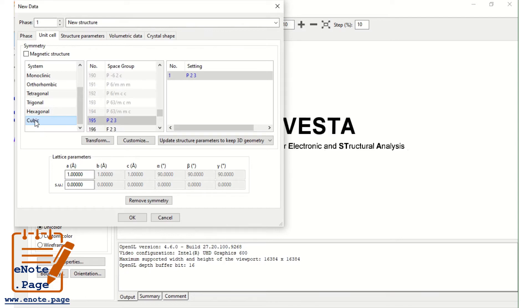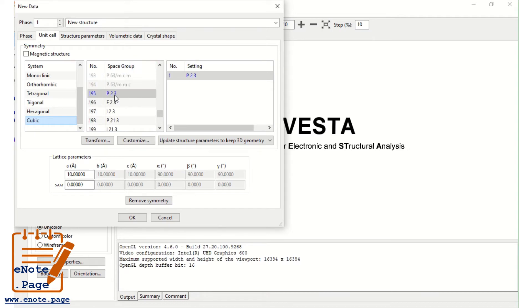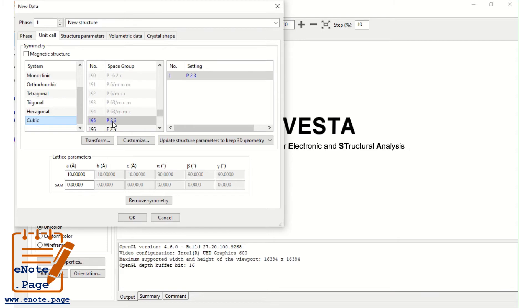A cubic crystal means the lattice parameters A = B = C, and the interfacial angles alpha, beta, gamma are all 90 degrees. Let us assume the lattice value as 10 angstrom. For the cubic crystal system, we are having different types of space groups. Let us take P23 as the space group for the cubic crystal system.